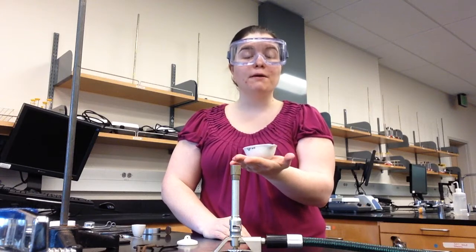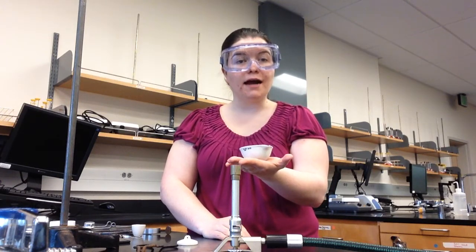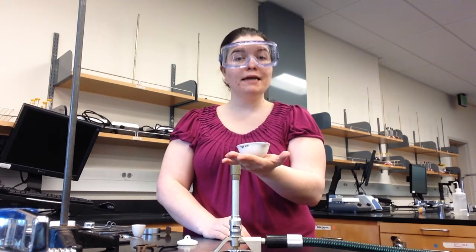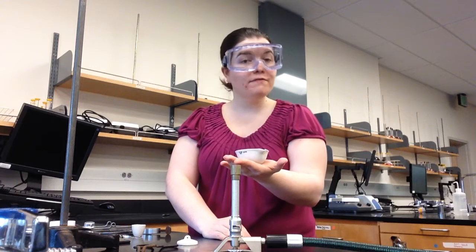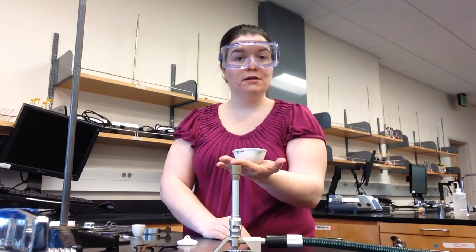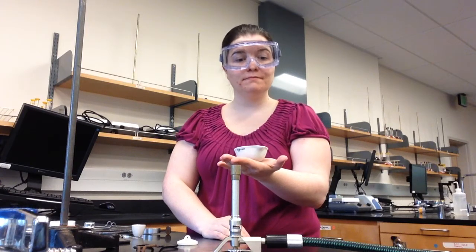There are two reasons why we should not weigh hot objects. The first, if the object is very hot, it might break the balance itself. But secondly, when a chemical is hot, a chemical or a physical change may be occurring that is causing the mass of the chemical to change. We only want to measure the mass once the mass of the chemical has stopped changing.